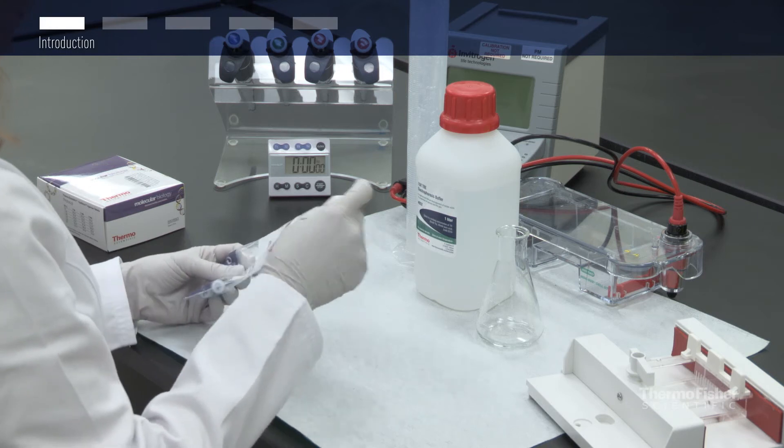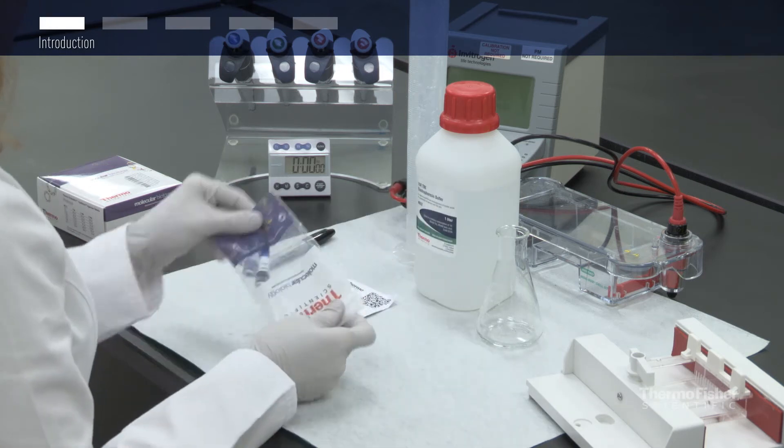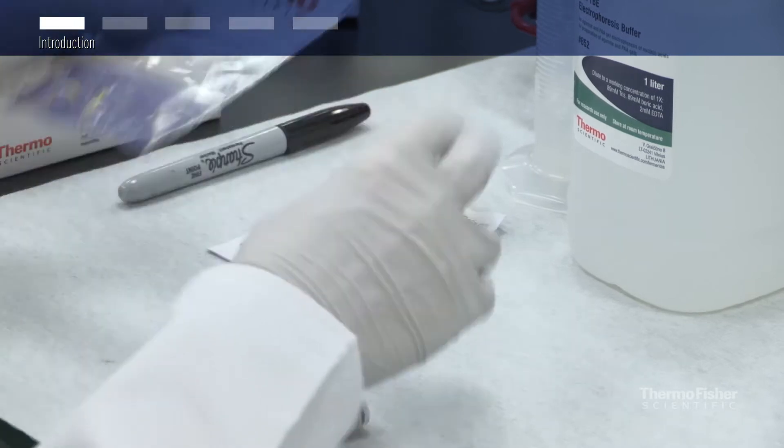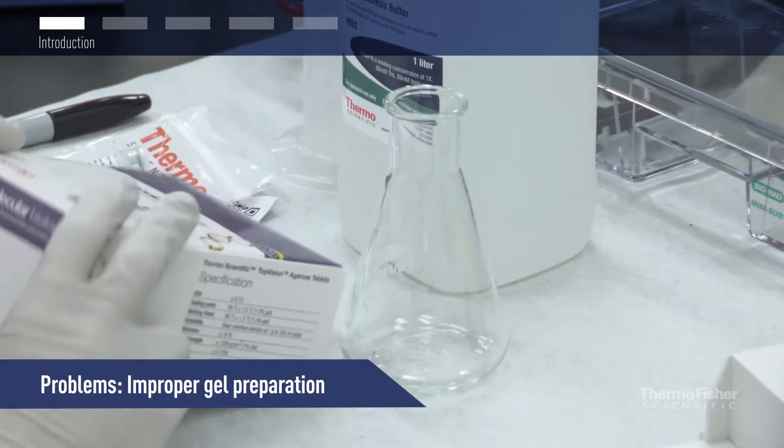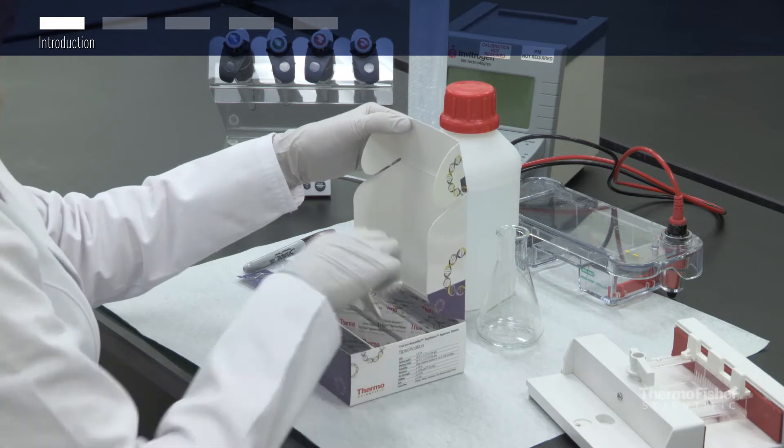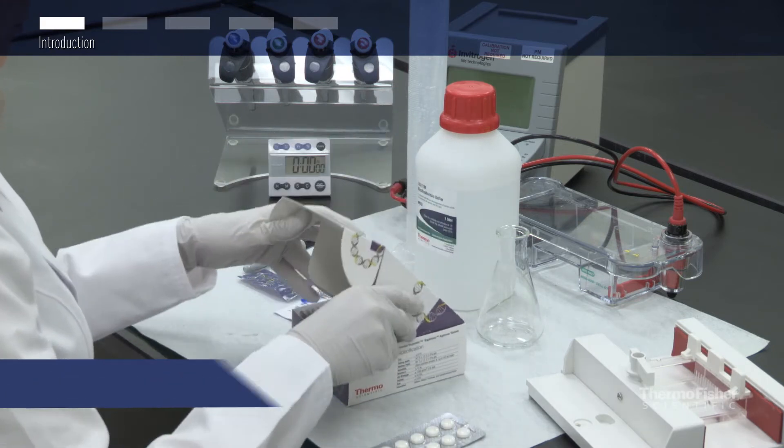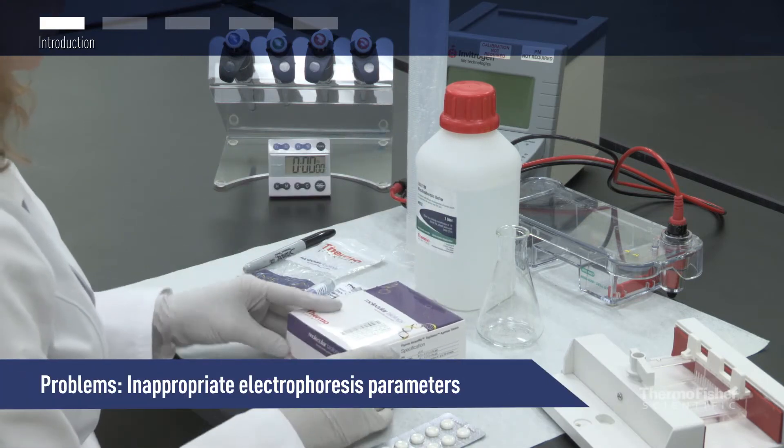When running agarose gel electrophoresis, a high-quality DNA ladder is essential. But problems can arise and often stem from the following areas: improper gel preparation, overloading the gel, and inappropriate electrophoresis parameters.